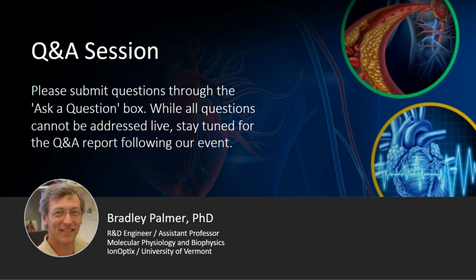On a similar note, what would you say are the most critical steps in a slice preparation? And I suppose that would kind of be your opinion in a way. How do you feel is the most critical? Solution preparation, I believe, is often the most critical. Of course, you'll have to have enough practice that you have the hands and the dexterity and already figured out all the tools that you need. Once you've gotten past that, it's really the solutions. The solutions have to be of the highest quality to make sure that your preparations are consistently good.